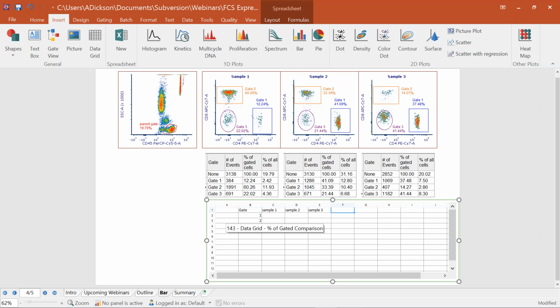And within this, I'm actually going to treat these 3 different samples as replicates. So we'll do an average for graphing. I'll also add in a standard deviation in my spreadsheet, which I'll use for my error bars. And then I'll also add my highlight parameters as well.